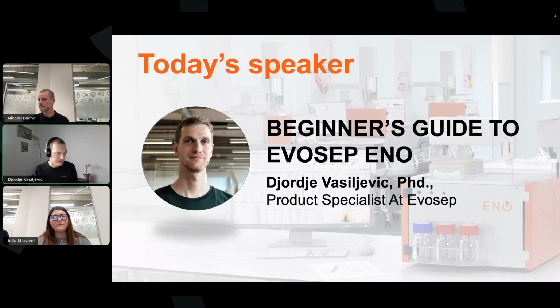And Evosep columns will be perfectly capable of handling 1 microgram, but the problem is if you're running it on, I don't know, a timsTOF Ultra, this is going to be way too much and you're going to oversaturate your mass spec. This is also not something that you should do with the Whisper methods and ion optics columns, because this is going to heavily overload that setup. So the answer definitely depends on the mass spec and on the application, or actually the LC method that you're planning to run. But 1 microgram is the upper limit of what can be done. And the lower limit does not exist.